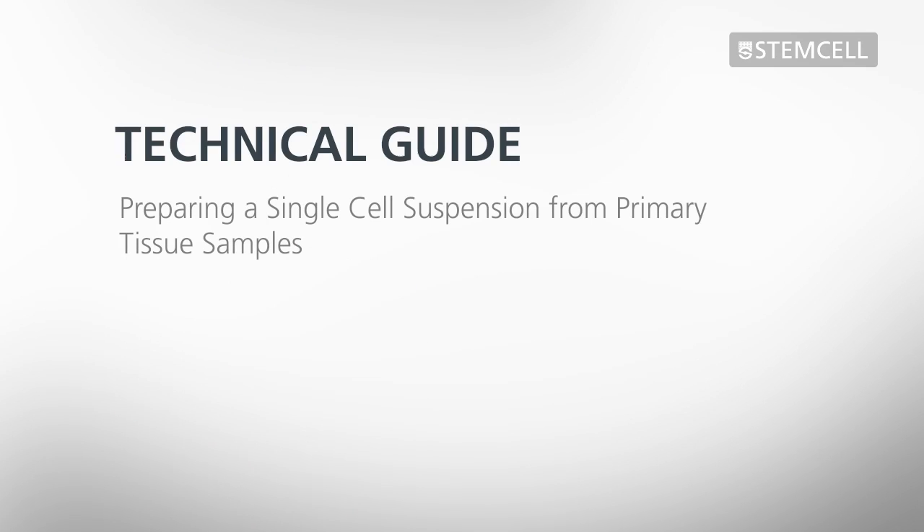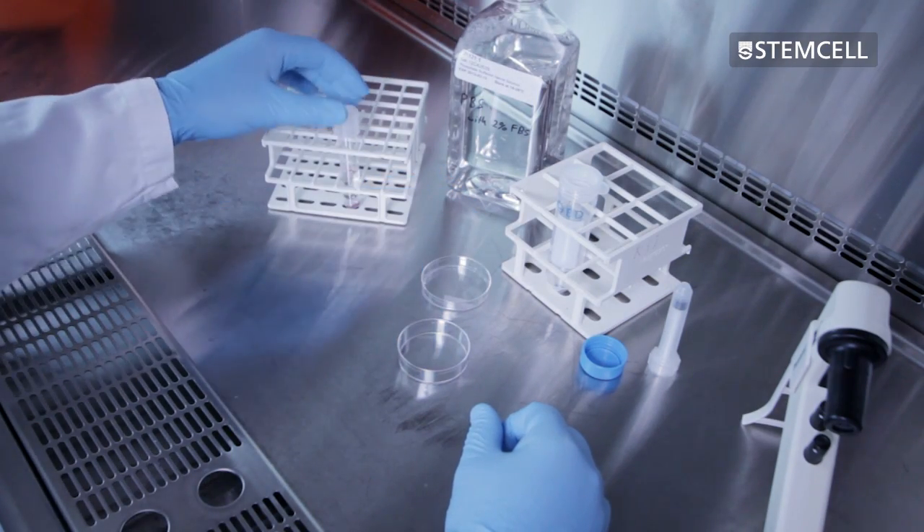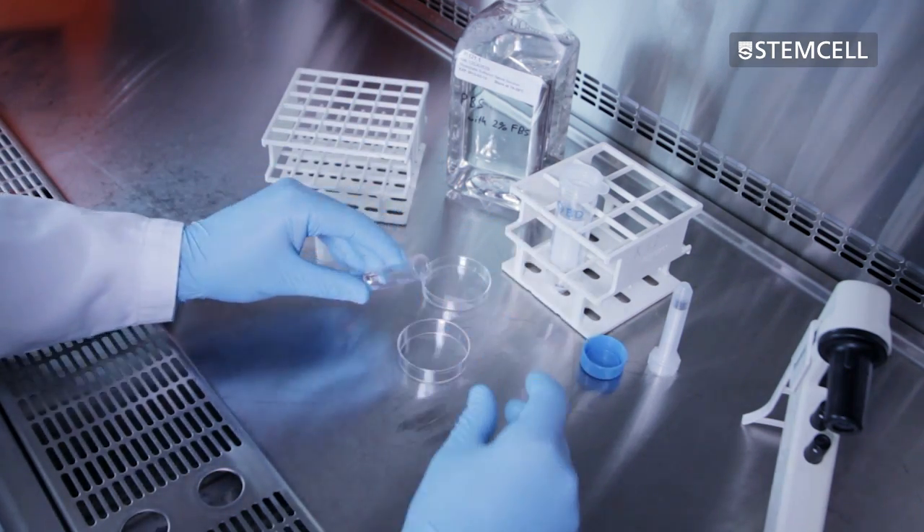This video outlines a method to harvest cells from a primary tissue sample and prepare a single cell suspension prior to performing cell separation. When working with primary tissue samples, cells must be dissociated from the tissue in order to prepare a single cell suspension.